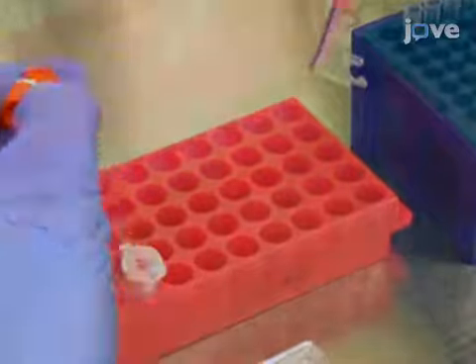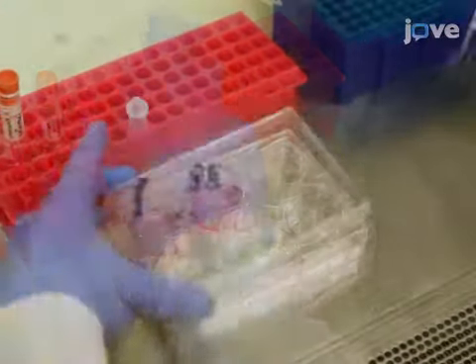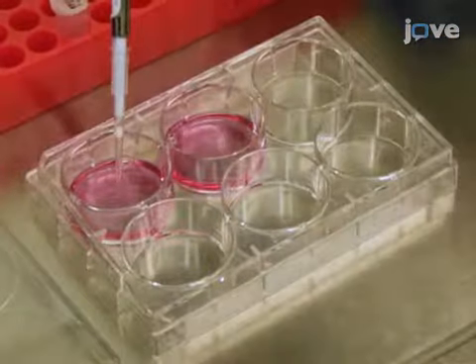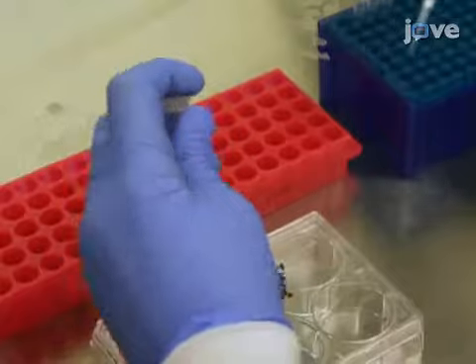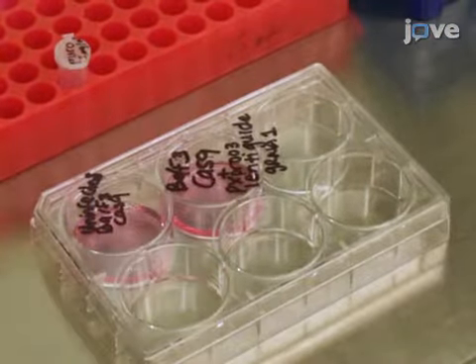Infect the Cas9 expressing cells with single-guide RNA using lentivirus. Then, use 2 micrograms per milliliter of puromycin to select the cells for 3 days, 48 hours post-spinfection.